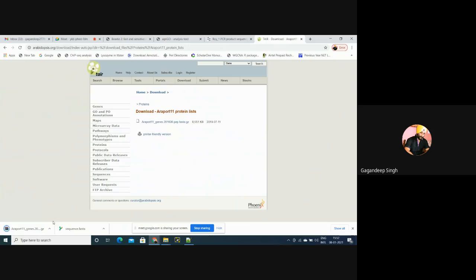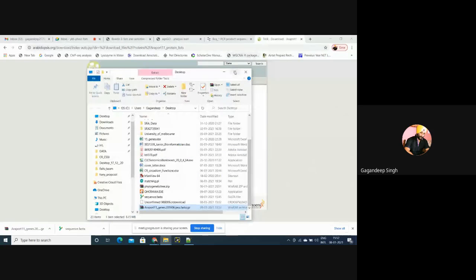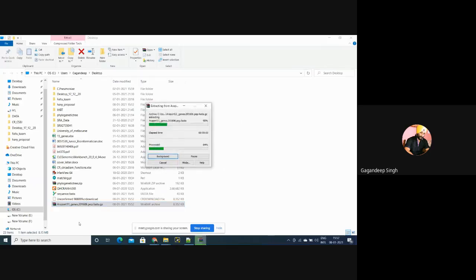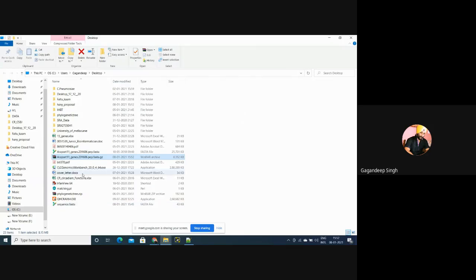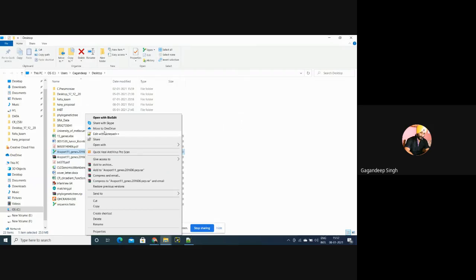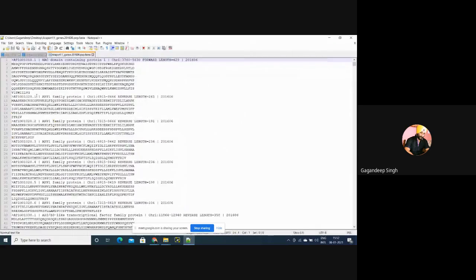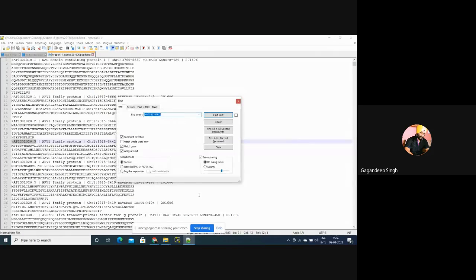But in case of humans, genome is already available. You don't need to find some model organism. For example, my first sequence is related to this particular sequence, second is related to this, third is related to this, for example. Okay, so I'll select randomly 20 sequences.